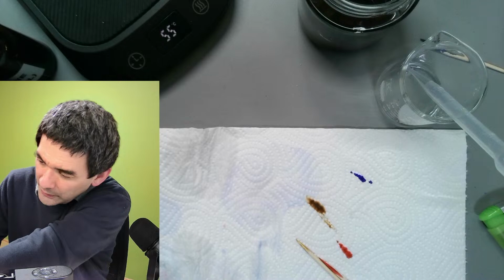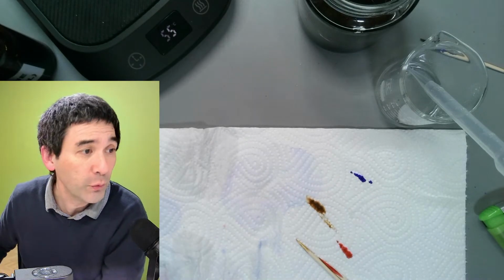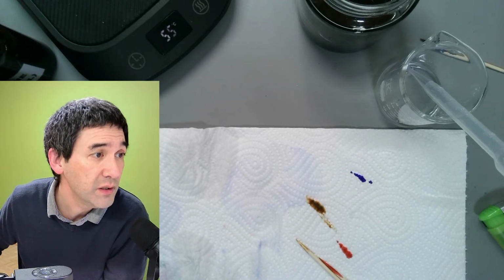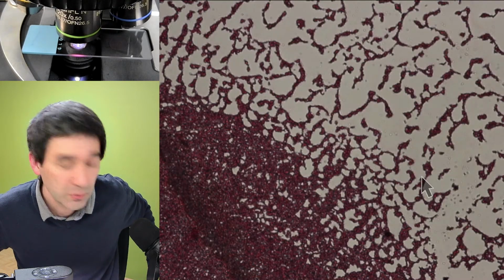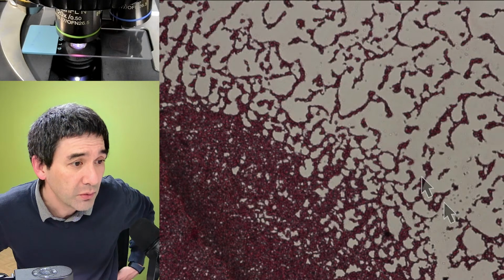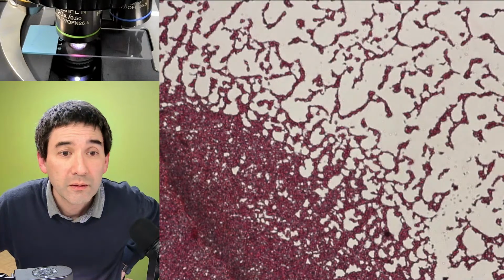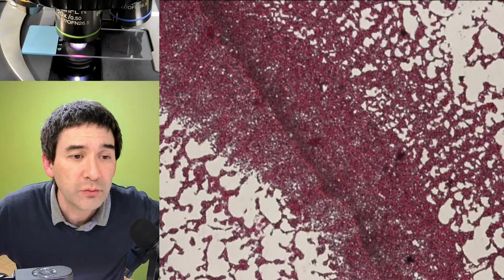I'm going to put it under the microscope, and we're going to look at it without oil immersion first. You already know that I'm not a fan of oil immersion, but occasionally it is necessary. Let's remove the arrow as well. Ooh, it seems to be Gram negative. That's the wrong arrow. Arrow gone. Oh, also the first one. That's definitely red, right?